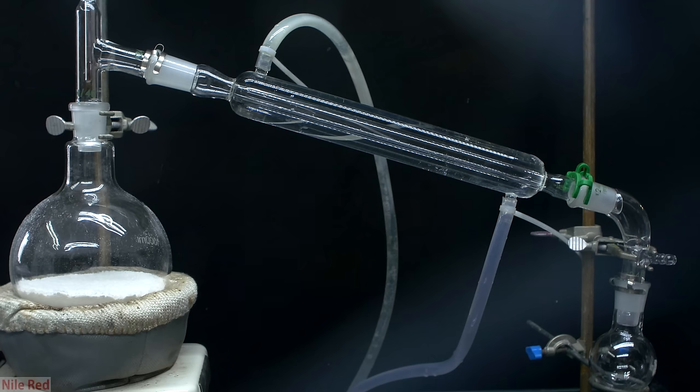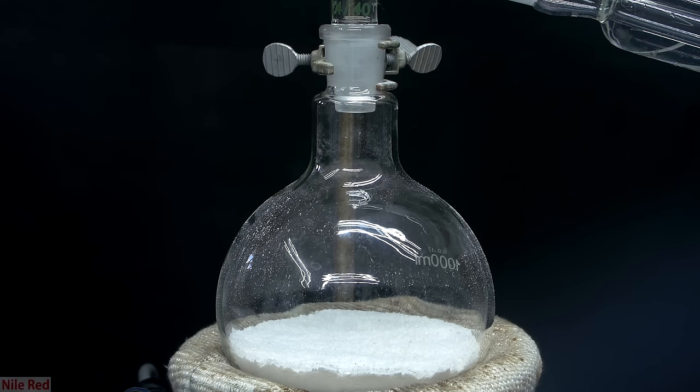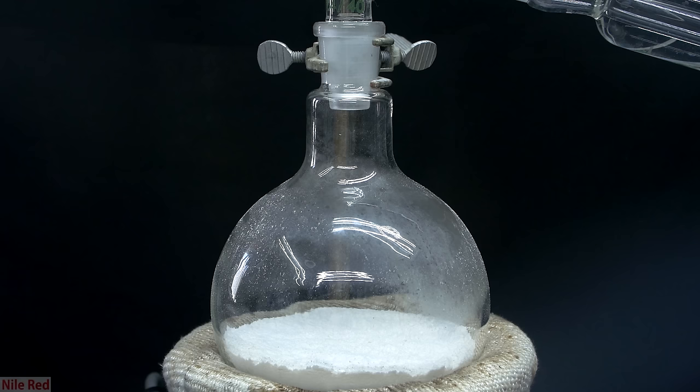The entire apparatus that I set up can be seen here. Below the flask, I have a heating mantle which will provide the heat for the distillation. I have a condenser column with water running through it, and on the right, I have my receiving flask. With everything set up, I turn on the heating mantle and I start to heat things up. As things warm up, the first thing to come off is a little bit of water, and you can see it fogging up the flask a little.